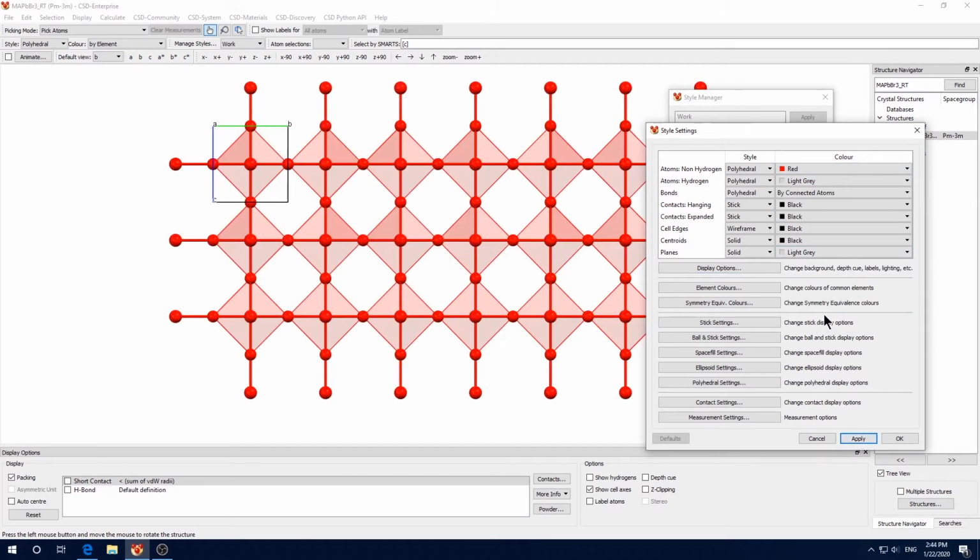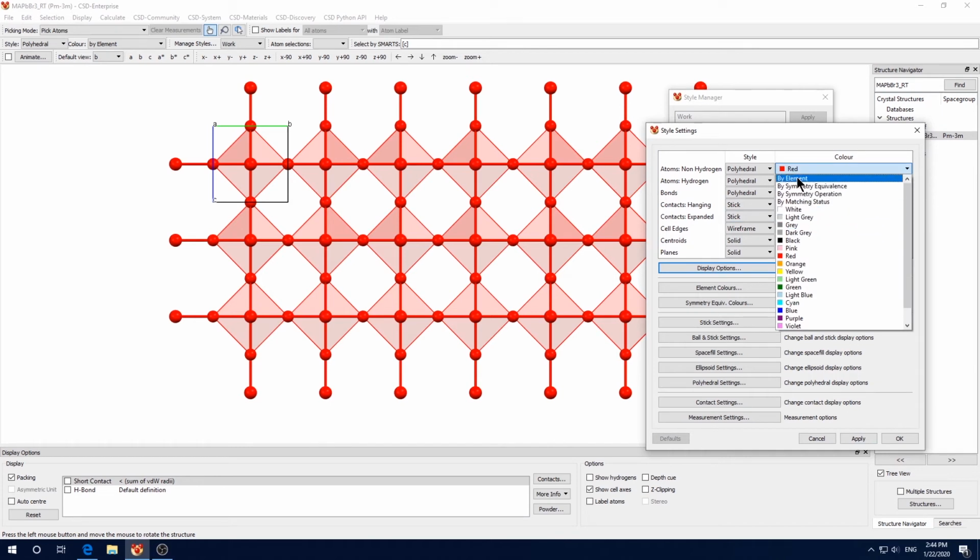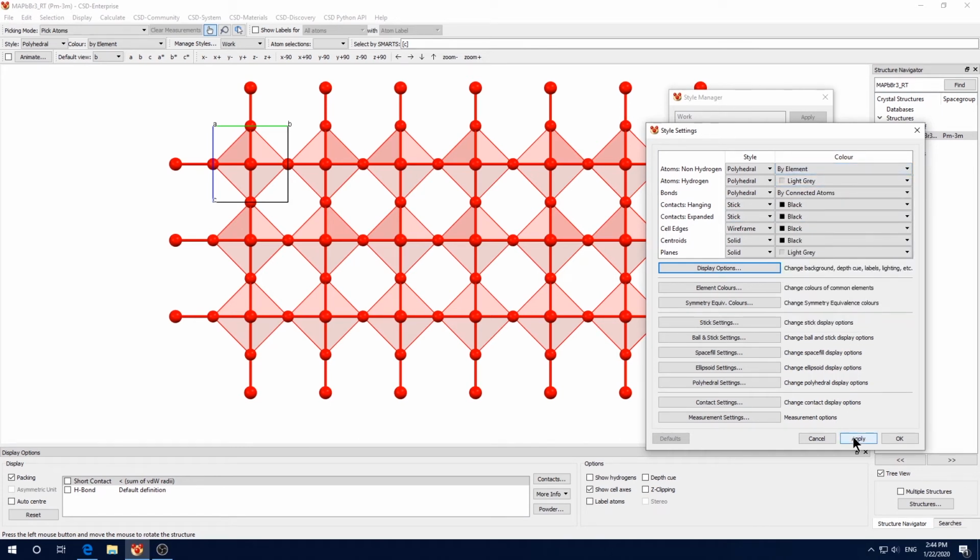Click apply. This looks like a red lantern, a Chinese lantern. But in most cases, you want to choose to show the drawing by color. But you can choose whatever you like. This is just my personal preference. And this is the first selection you want to customize.